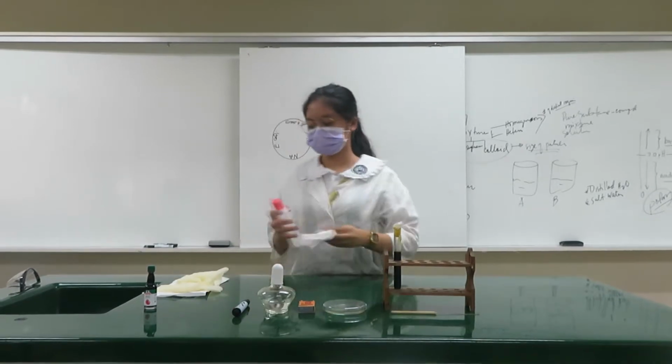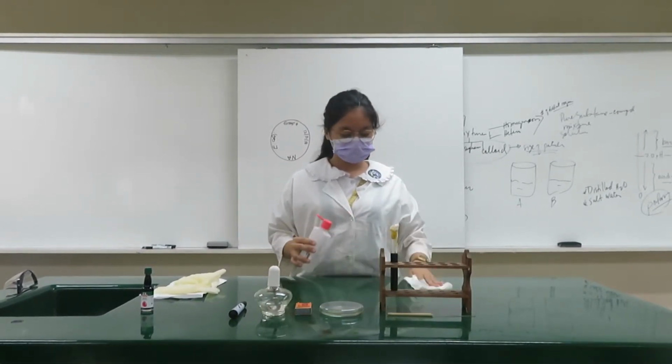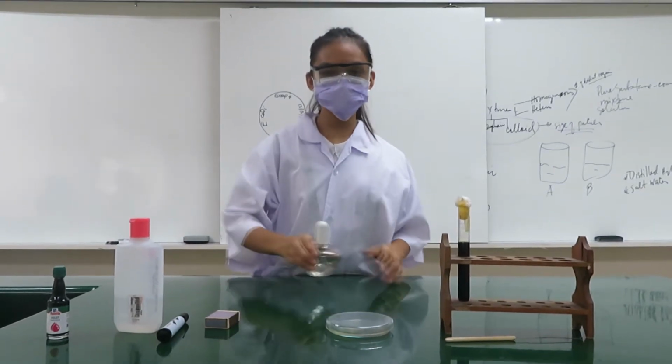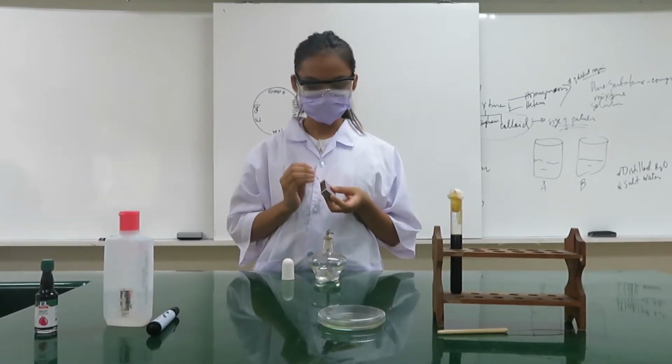3. Remove all the materials blocking your workspace. 4. Using 70% volume per volume ethanol, clean your work area. 5. Set up the alcohol lamp and work cautiously near the flame it creates, which is a sterile field.